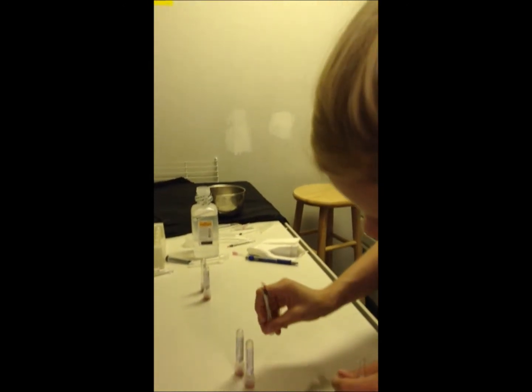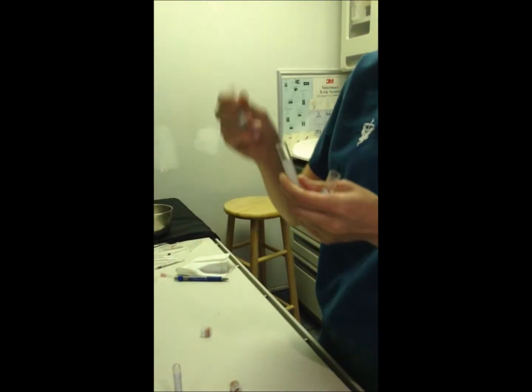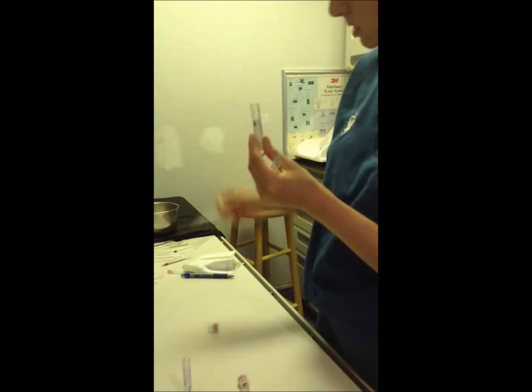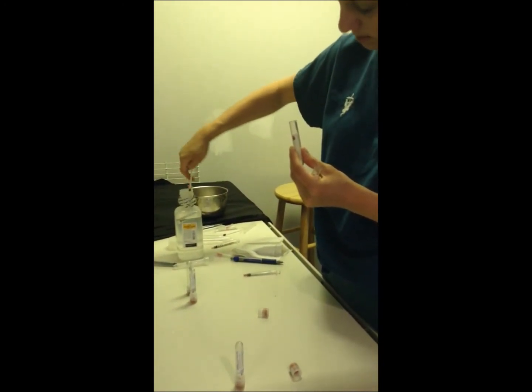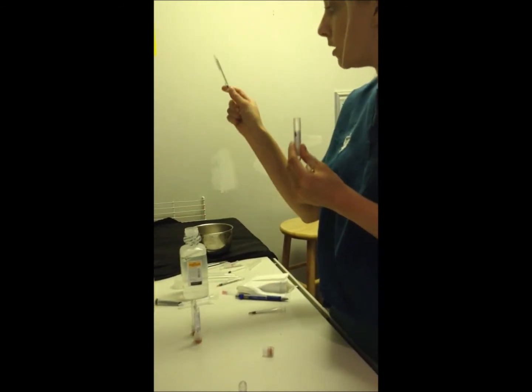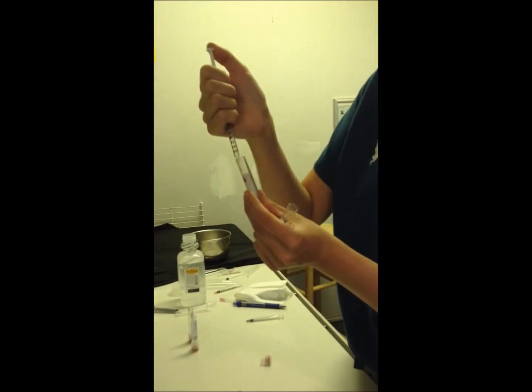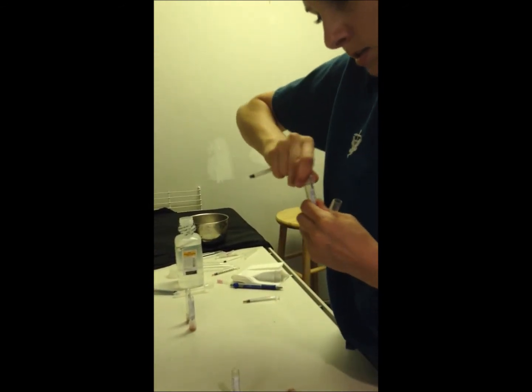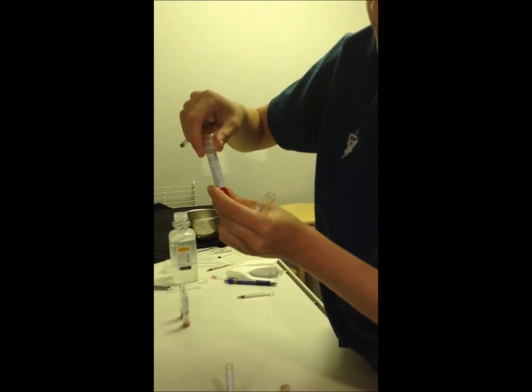So it's a very, very small amount, and we have Ruby's suspension here. So we're going to go ahead and put the 0.02 in there, and then we're going to put 0.98 in here. You want to make sure you measure it correctly and get all the air bubbles out. Okay, so that's 0.98. I'm going to go ahead and mix that.